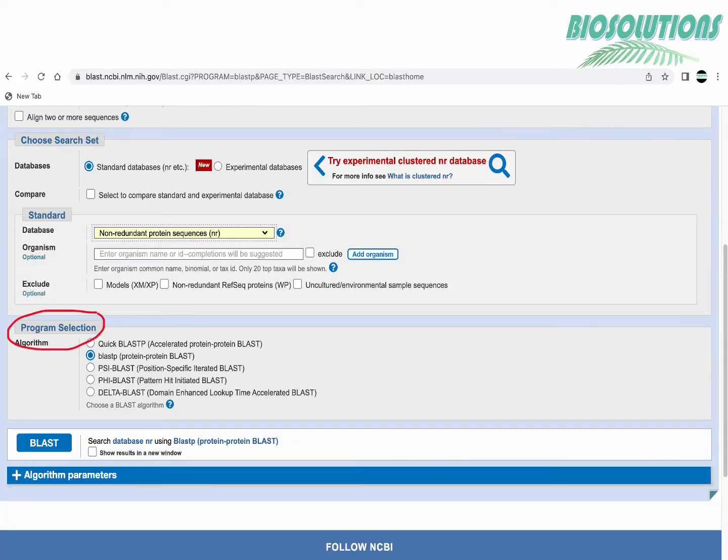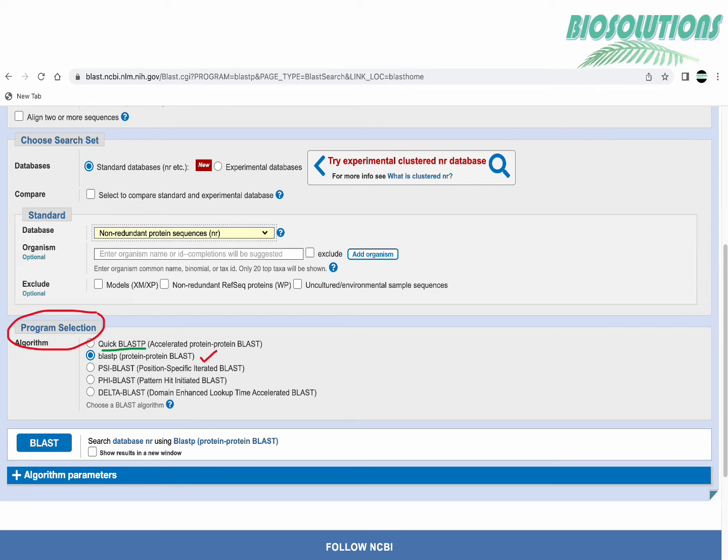The next section is the program selection. Here we have a few choices and by default BLAST-P protein to protein search algorithm is chosen. If you choose quick BLAST-P it's very fast and should be used only when your query has at least 50% identity with database sequences.